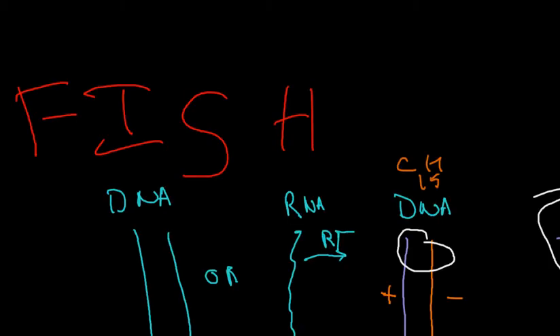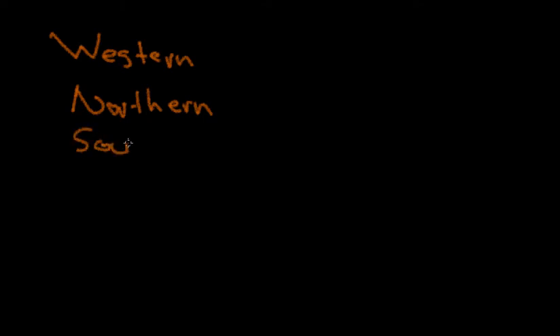Okay, so what are we talking about today? Today, what we want to talk about is genetic probing, or how to study gene and gene product. So we're going to look at Western, Northern, and Southern blotting.